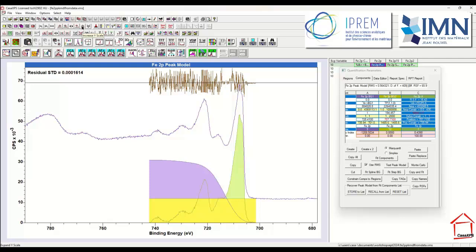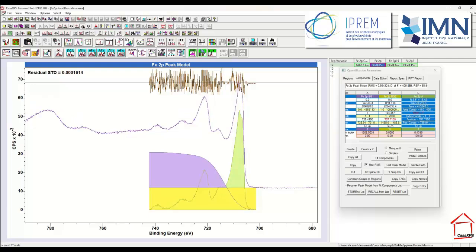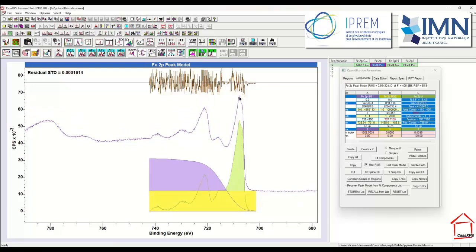If on the other hand I hold the control key down, then what happens is the range goes in a negative sense, so you can get to see further below the 0 background. So if I don't hold the control key down, I'm raising up the scale, therefore pushing down the intensity that is displayed, so I get to see the spectrum as I might want to see it.